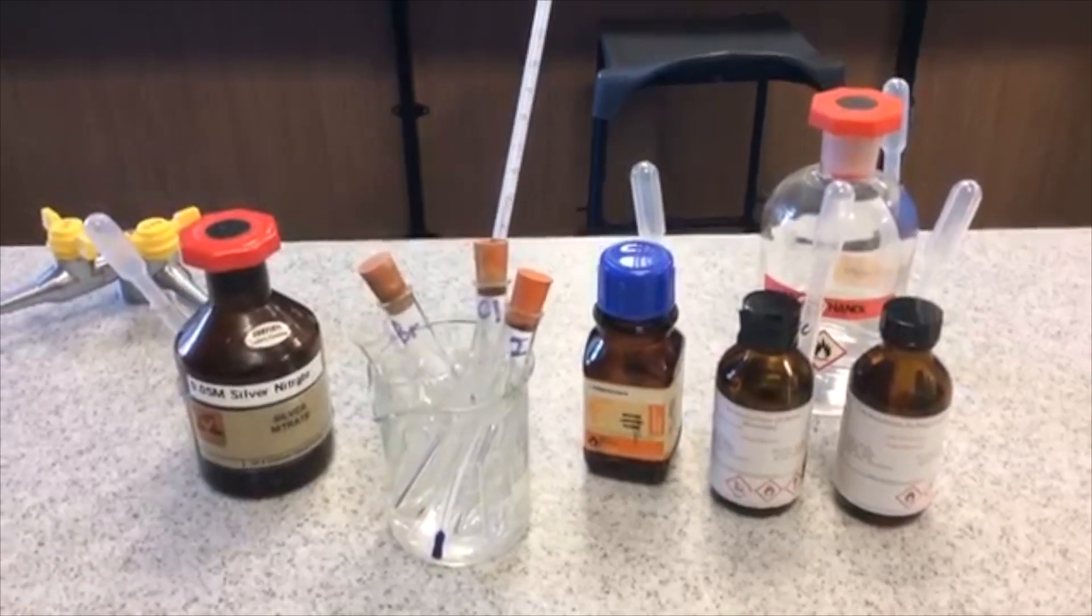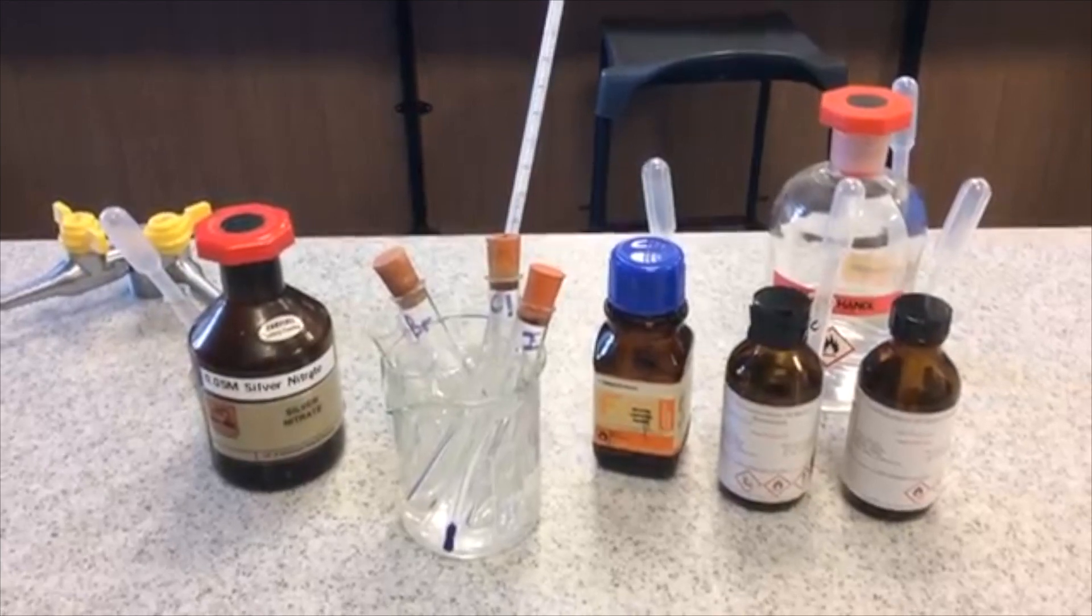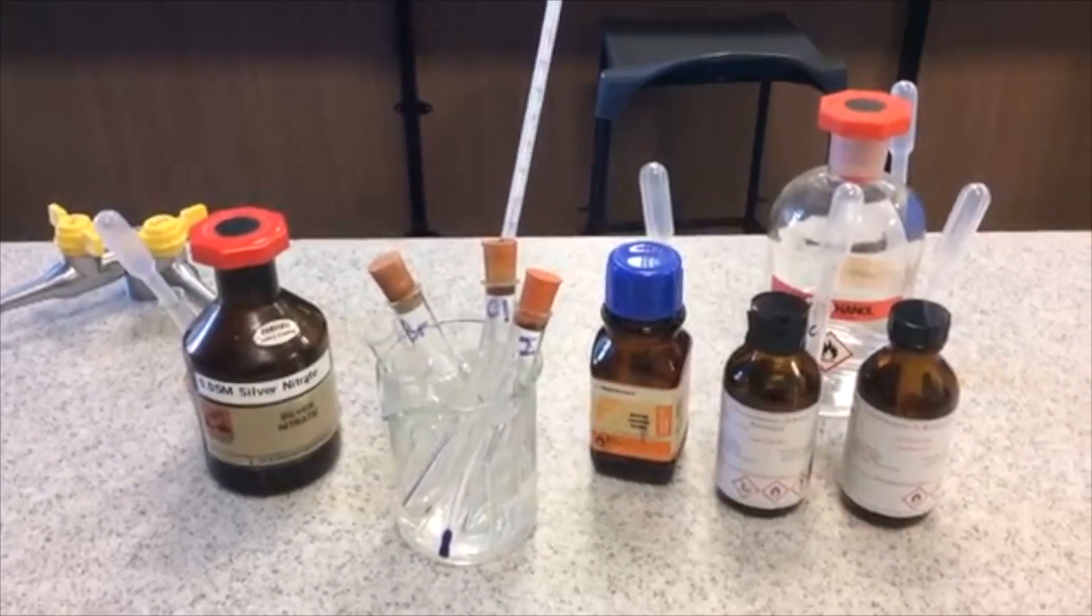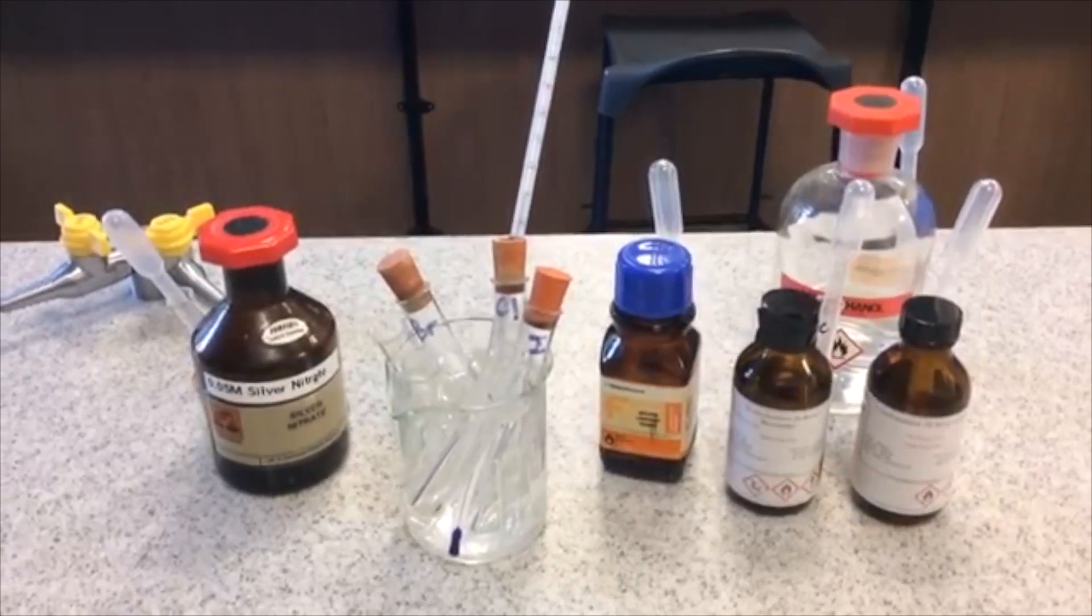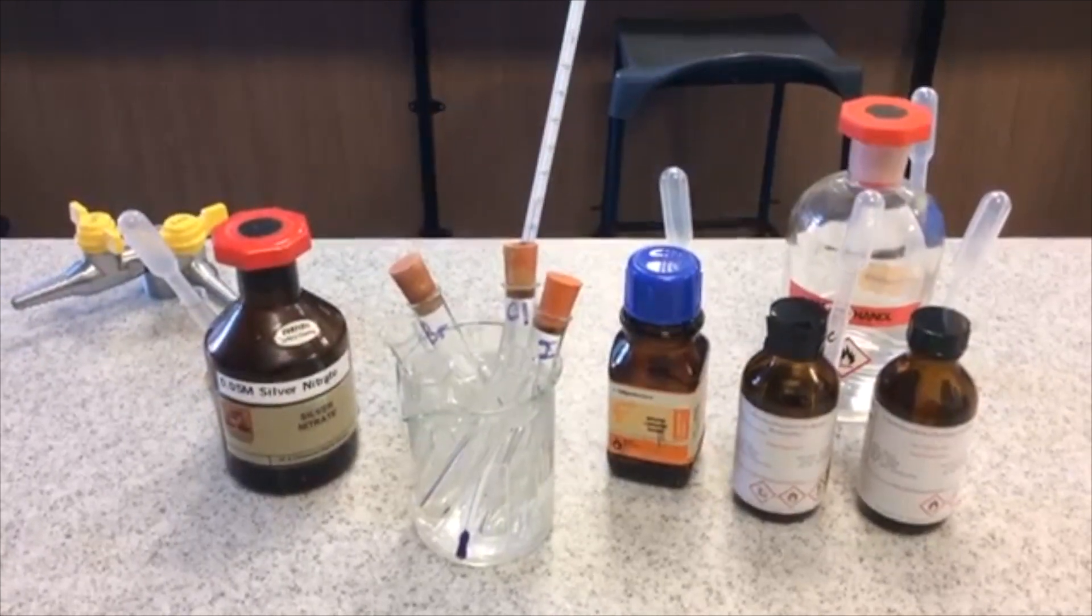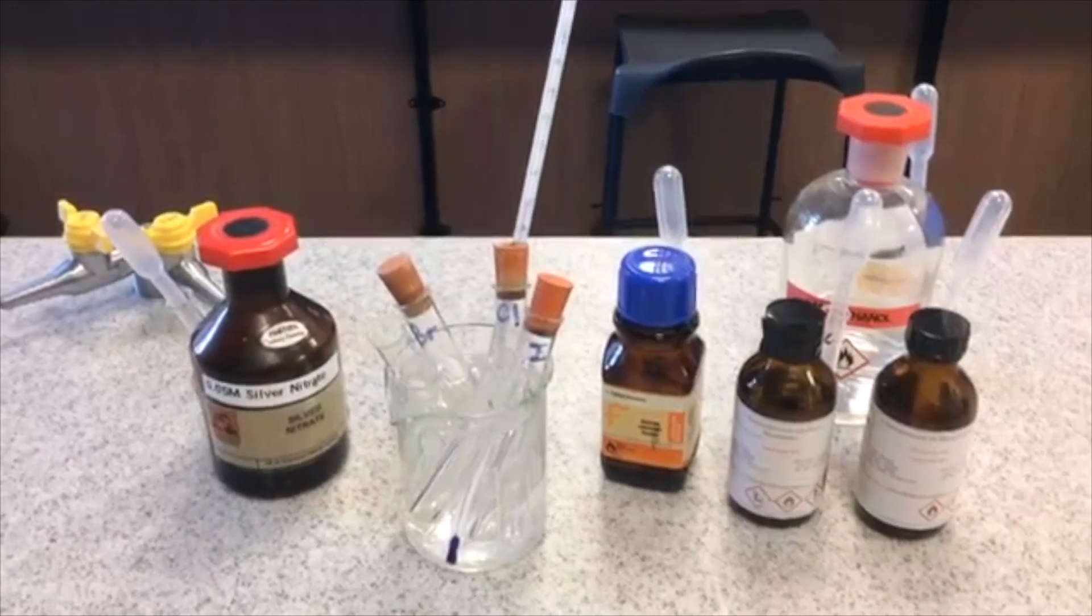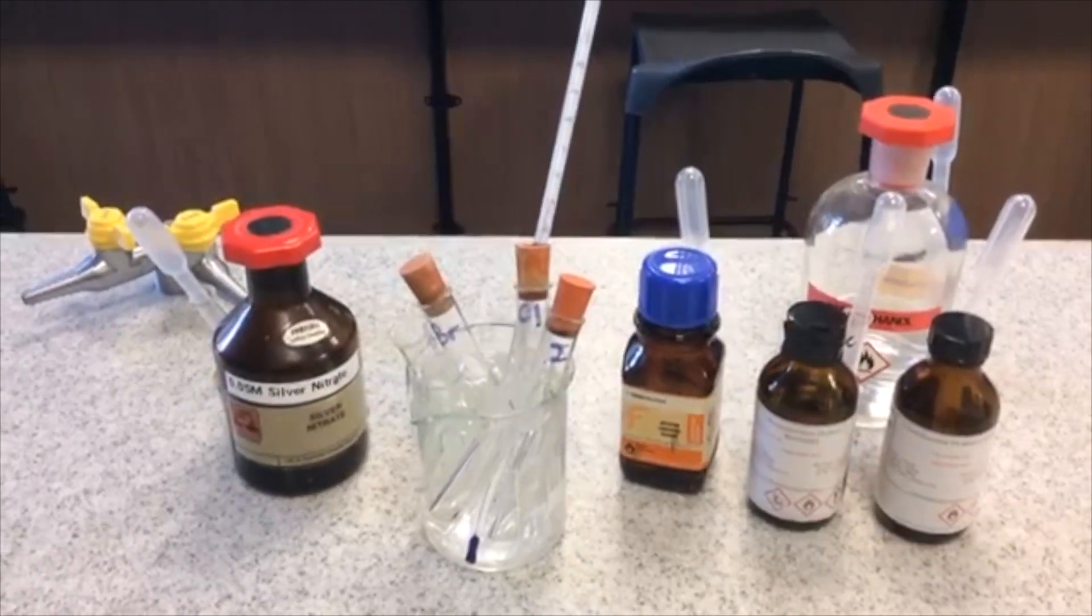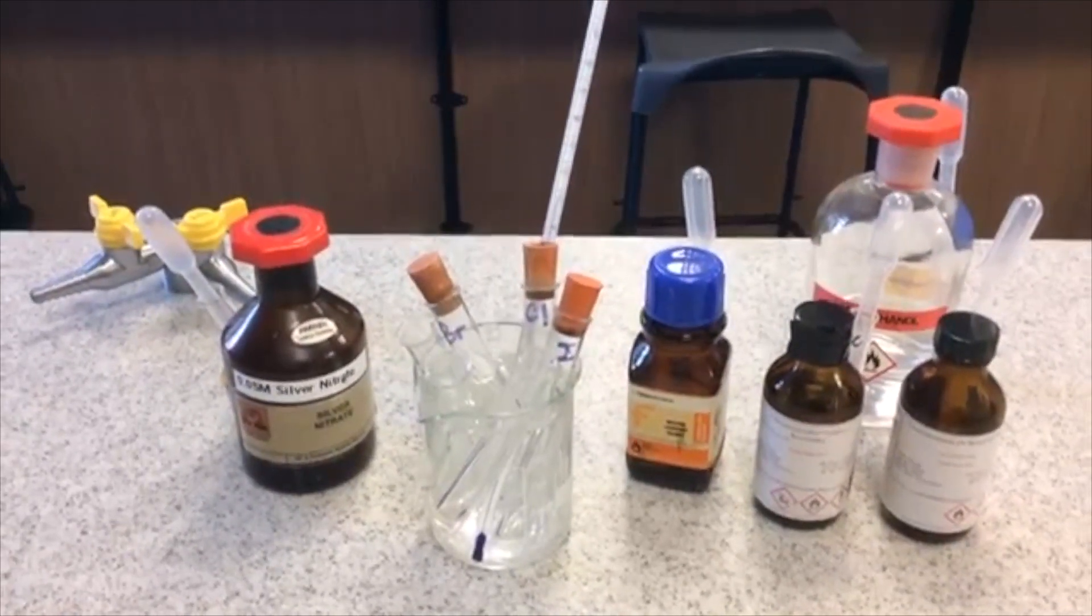I've got my three labeled test tubes: the BR test tube has the bromobutane in, the CL has chlorobutane, and so on. They're in ethanol, and the test tubes without any rubber bungs have the silver nitrate solution in.